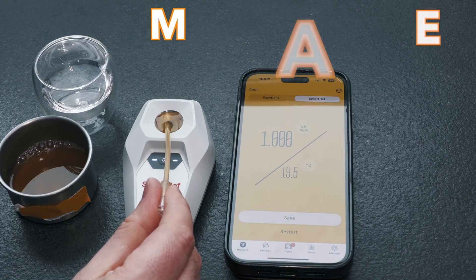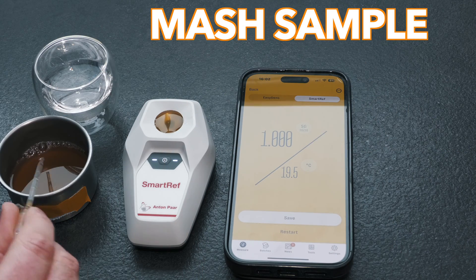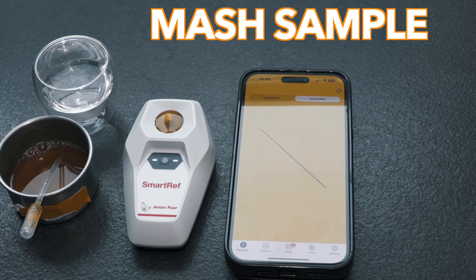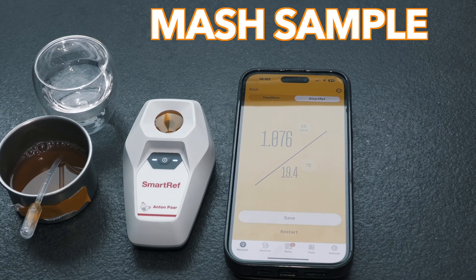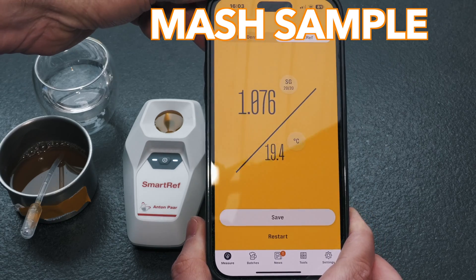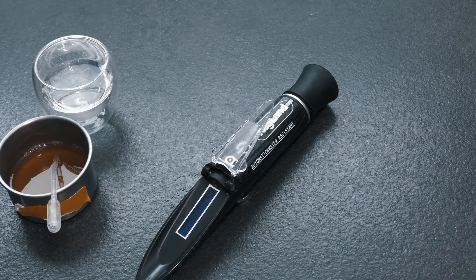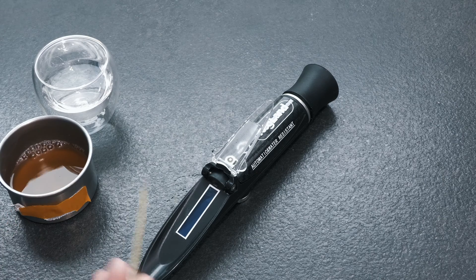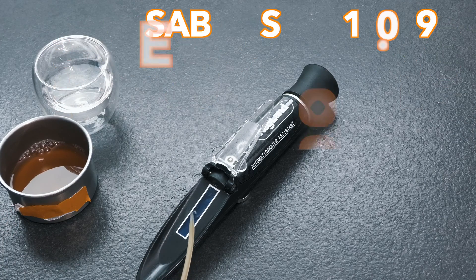The first sample was then taken from the high gravity mash, and I started by loading this into our benchmark device, the SmartRef, to see the accurate result. This delivered a specific gravity result of 1.076. I then brought out the Kegland Sabre refractometer and loaded it with the same sample, and got back a specific gravity value of 1.079.